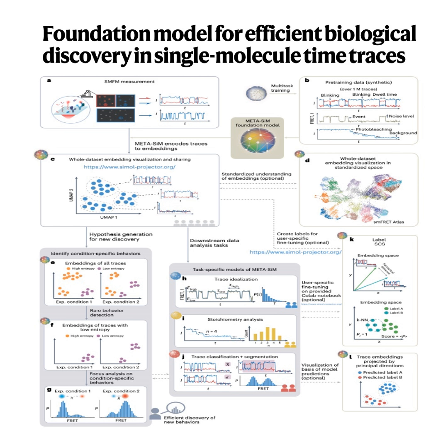Defined ground truth. Ground truth, meaning you know exactly what the right answer is. In a real experiment, you observe the fluorescence, but you have to infer the underlying states and the rates of switching between them. You never know for sure if your interpretation is perfect.